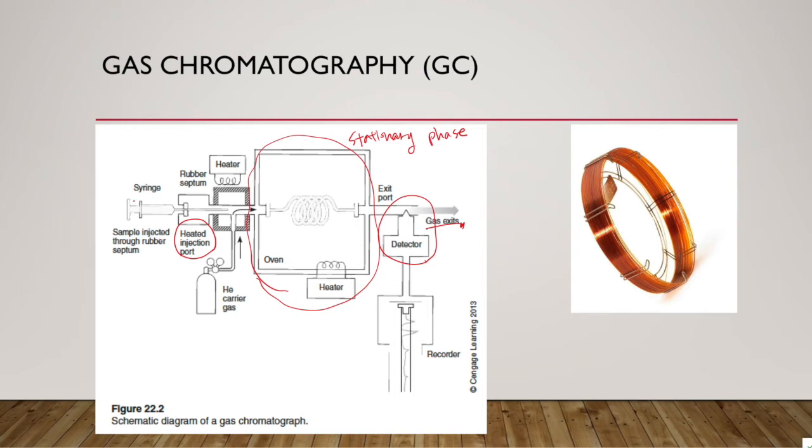So let's take a look at it from the beginning. Through the injection port, we only apply about 1 microliter of the sample. It's a really tiny amount.